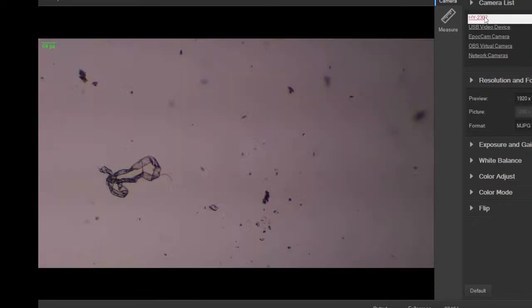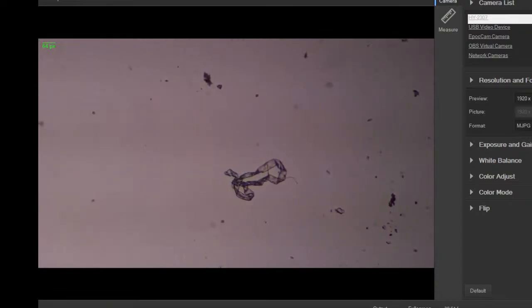Yeah, I got 2 overlapping cover slips. I got 2 by accident. Some more dead material there. Let me fix the center. Why is it not centering? I see what happened. Got a camera pause. There we go. Sometimes the camera doesn't refresh. There's some debris.